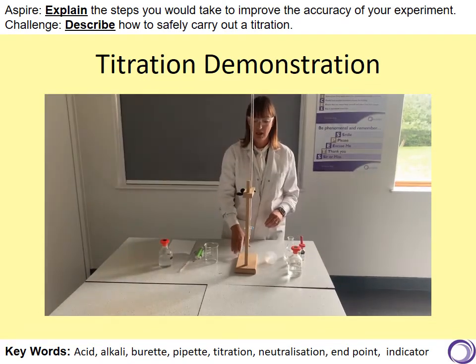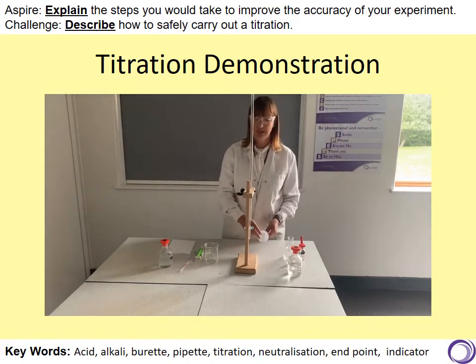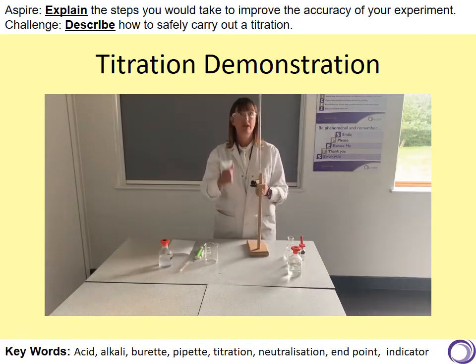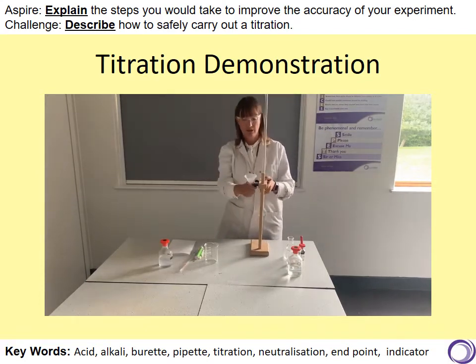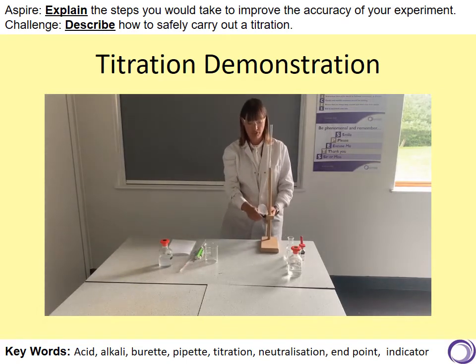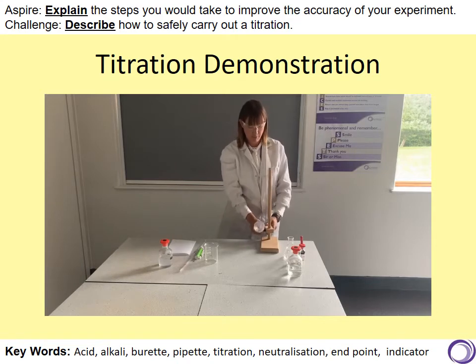Right, so first of all I'm going to fill the burette with acid. We are going to use sulfuric acid for this practical and I am going to use a funnel. Now this is quite high, so one of the things that students don't realise is actually you can just move this round and move it to a level that's more accessible.